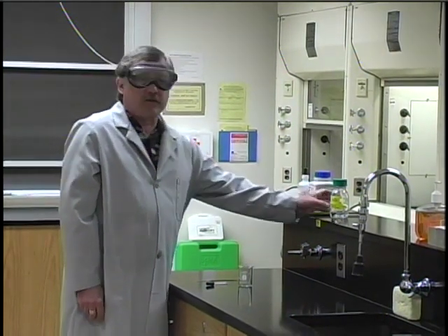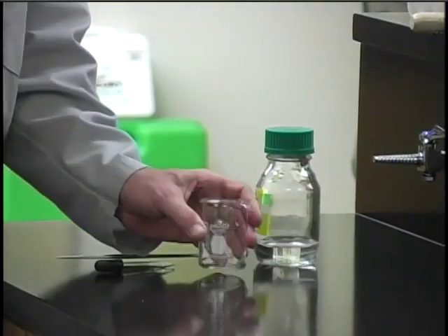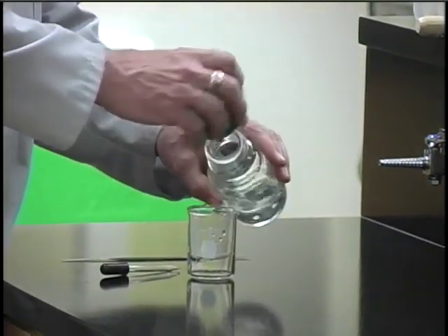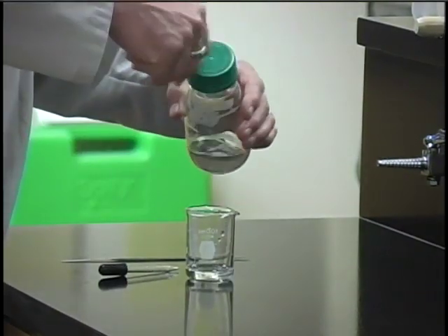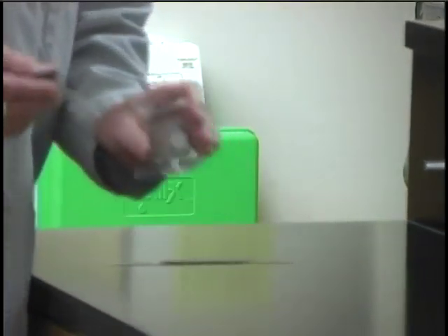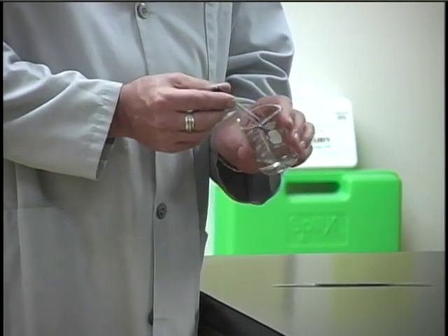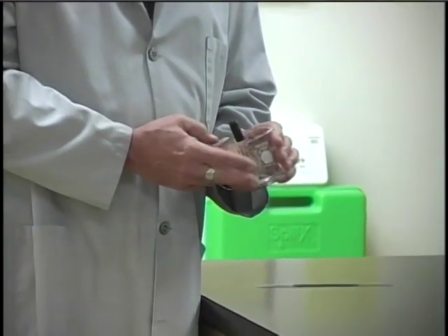Every now and then there may be a solution that does not have a dropper built into it. If that's the case and you need a little bit of that solution, take a clean beaker from your drawer and pour a little bit of the reagent into that beaker. Then it's okay to use the dropper from your drawer on that particular sample, because if that dropper is contaminated, you will have not ruined the reagent bottle.